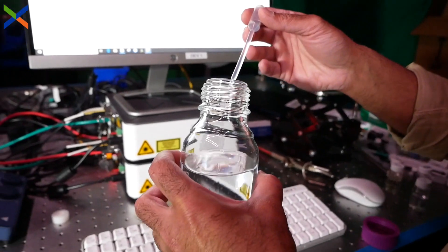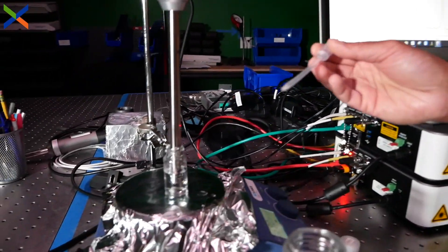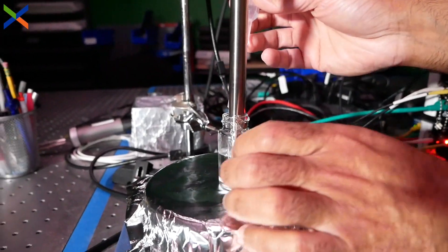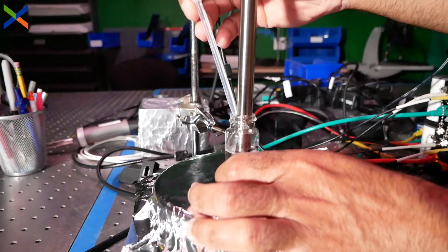Another test we can do is to dilute pure ethanol with water and watch the predicted percent volume of ethanol change in real time.